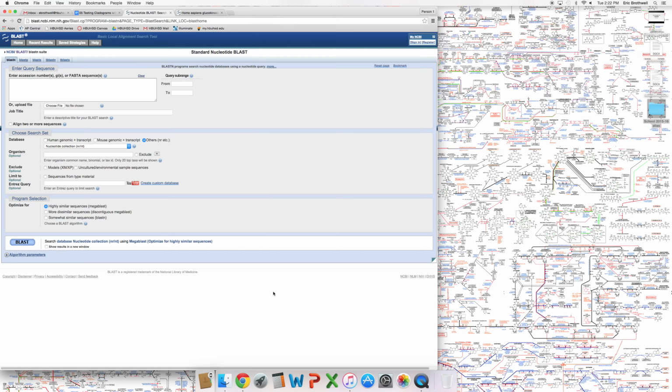Small e-values mean, hey, this thing turns out to work, meaning there's a good match between the DNA. The larger the e-value, the closer you get to 1, the more the two don't match in any way, shape, or form. And that's all you need to do for a BLAST search.